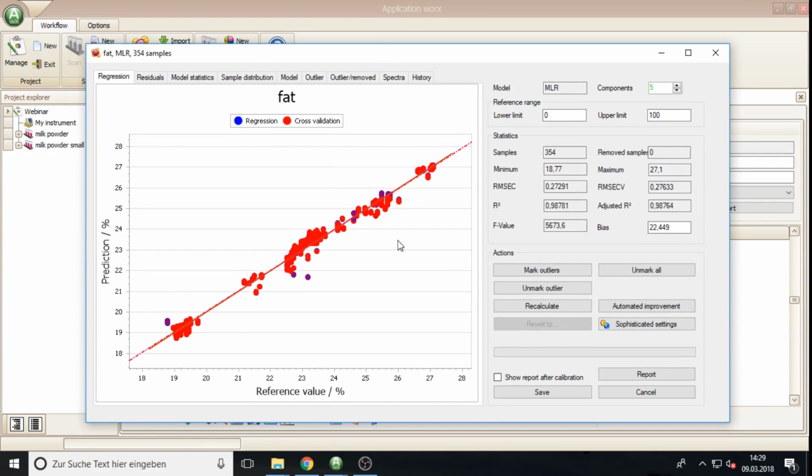So calibration is done, but I will go on with explaining this combination search, because so far we have just one model with one wavelength. Now we proceed in calculating the best model for 2 wavelengths, and therefore we take the first and the second wavelengths, calculate a model, once again save the statistics for this model, take now the first and the third wavelengths, calculate a second model, compare to the first, and decide which is better, and discard the worse one.